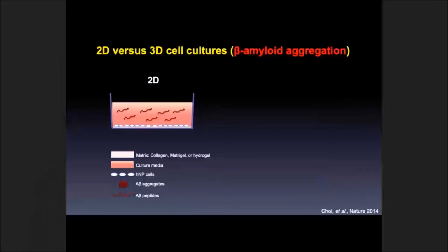So the initial failure was very, very hurting to us. And our postdoc who worked on this project was almost in depression mode, because there was a huge amount of work and a high amount of A-beta, so why were they not making pathogenic changes? And one thing we realized is that in this culture, we are changing the media every 2 to 3 days.